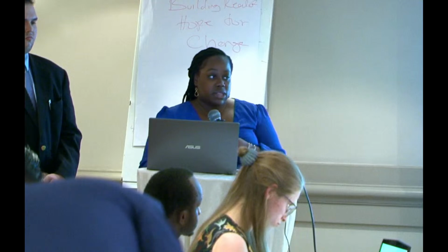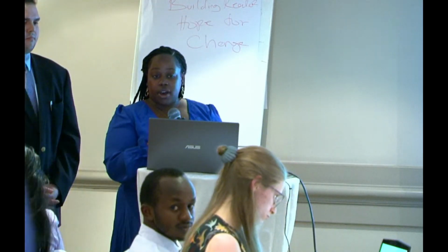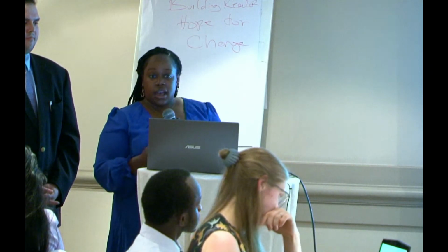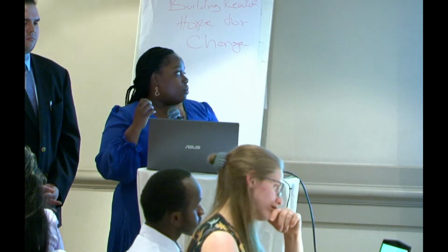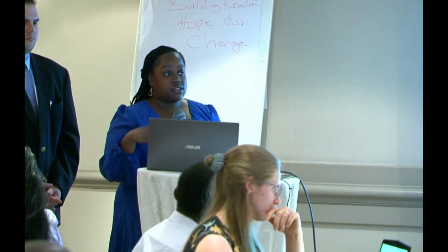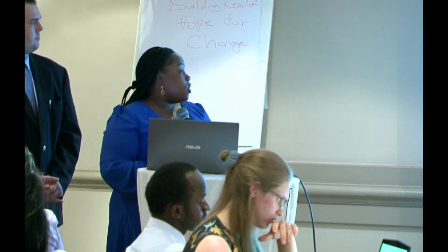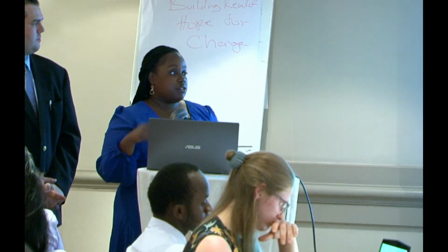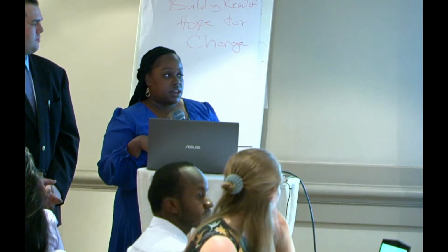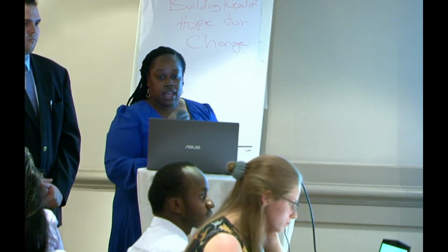So in the future, what we would like to do is use standards of the molecules from our molecular compound library, and compare that to our results, just so that we can more assuredly and decisively say that we did have these compounds in our HPTLC results. We also want to analyze the roots, the seeds, and the flowers, because those parts of the plant also had significant compounds that were very beneficial medicinally.